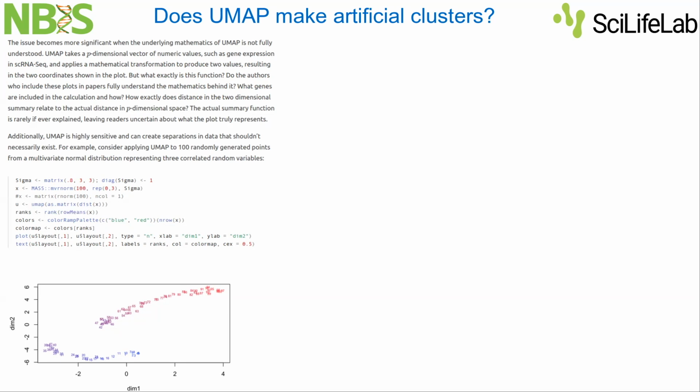And of course, we're saying that distances are not meaningless in UMAP. You just can't interpret them as true transcriptional changes or trajectory distances or times, but still the layout in the UMAP gives us some interpretation of the data. It's not just throwing things out for fun. We can still interpret some things from the UMAP. But maybe you can clarify what you mean with the doublets.